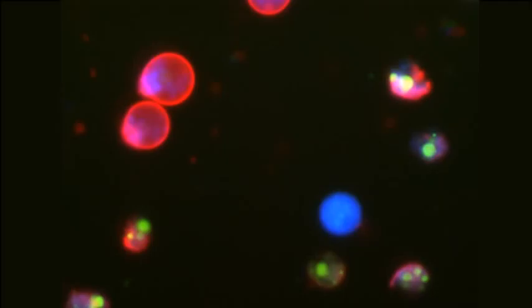The image shows Jurkat cells stained with Annexin-5 in red, Cytox green in green, and Vitabrite 48 in blue. The cells have been induced to undergo apoptosis using camptothecin. Only non-apoptotic cells, that is cells not stained with the Annexin-5 marker or Cytox green, show high mean Vitabrite fluorescence intensity.